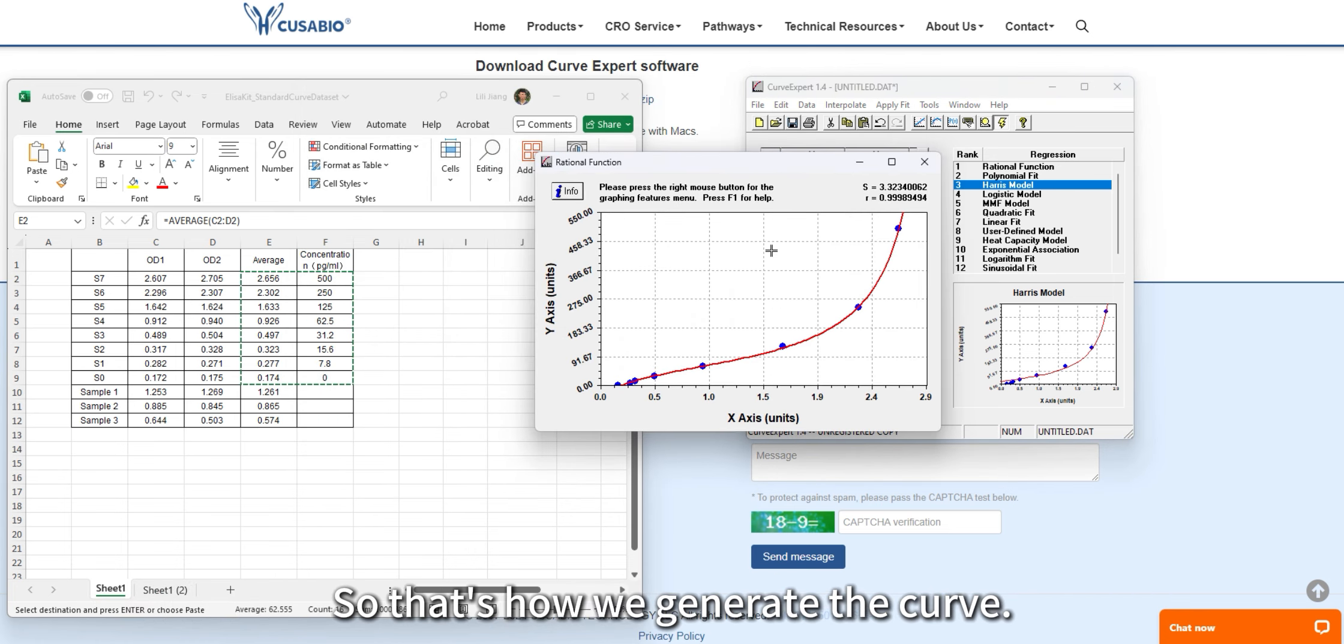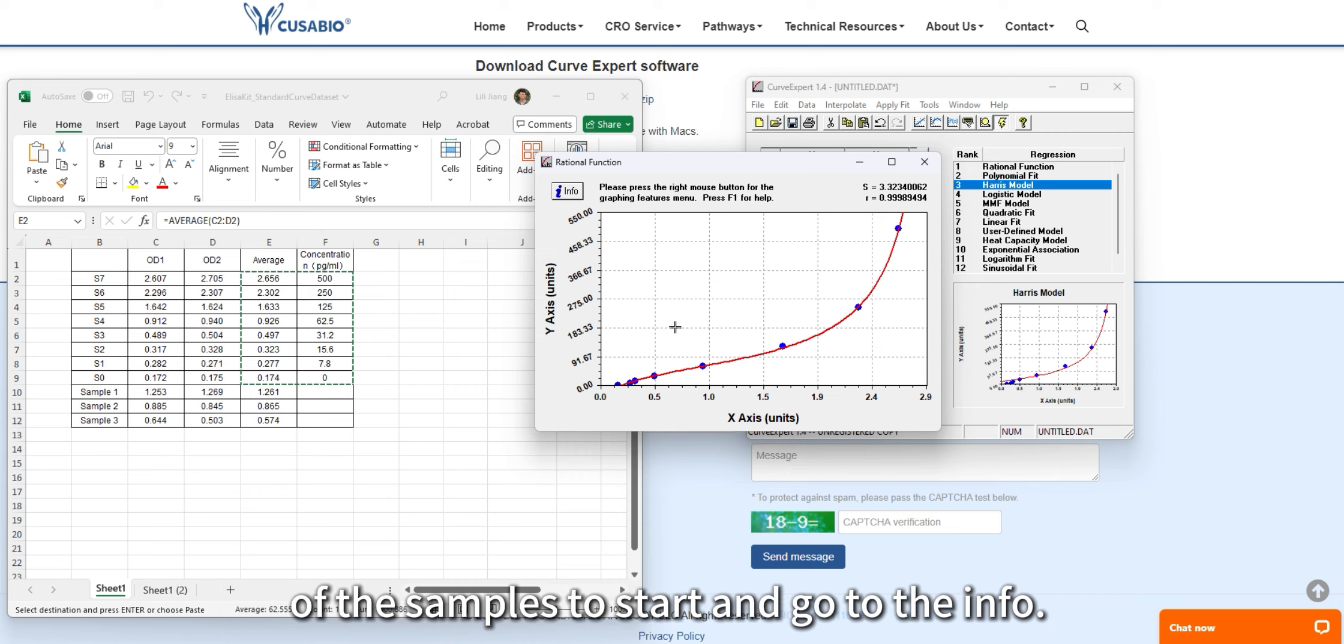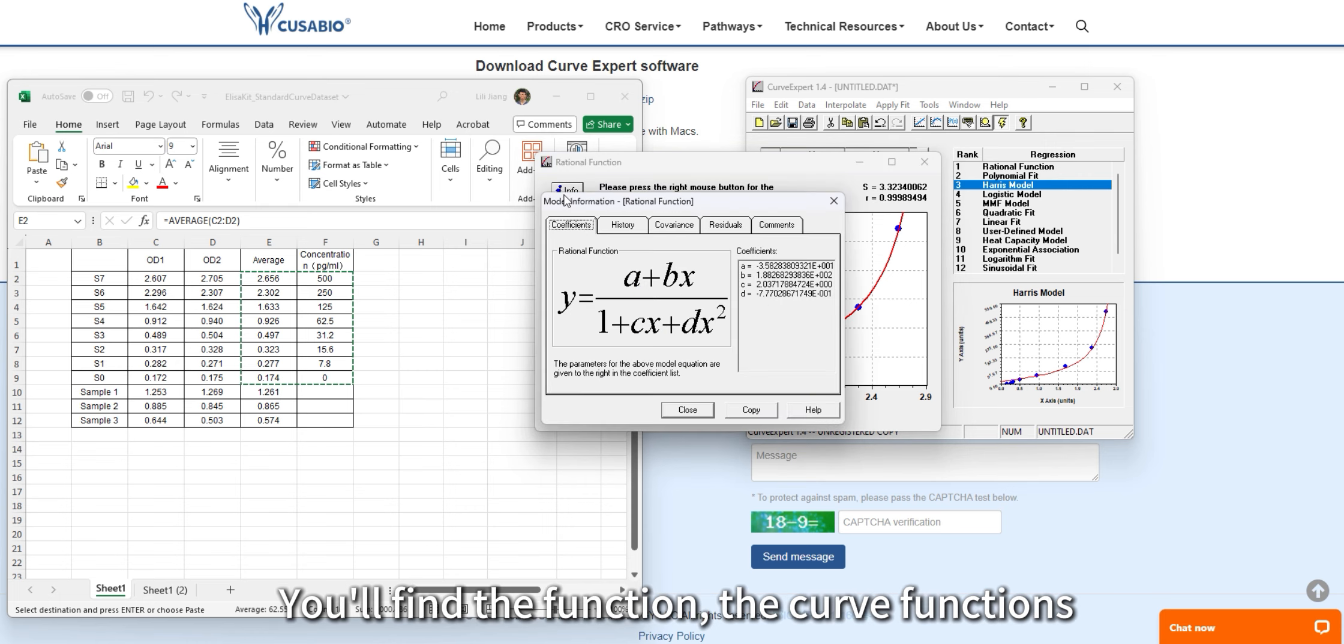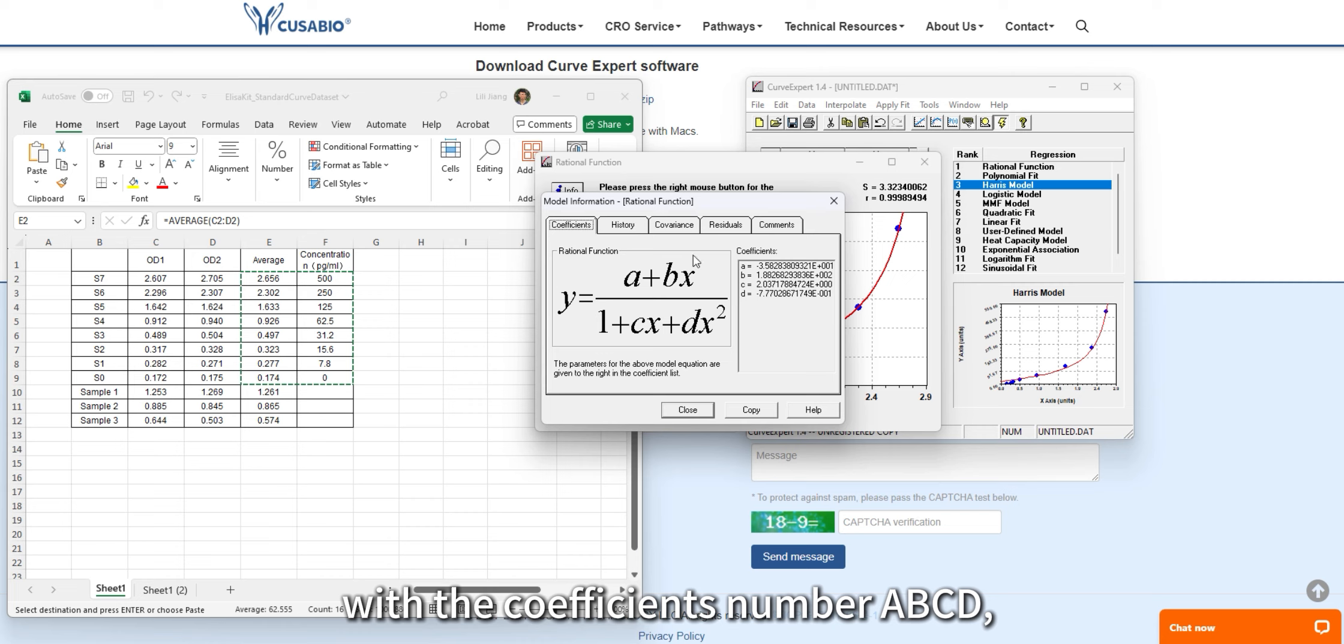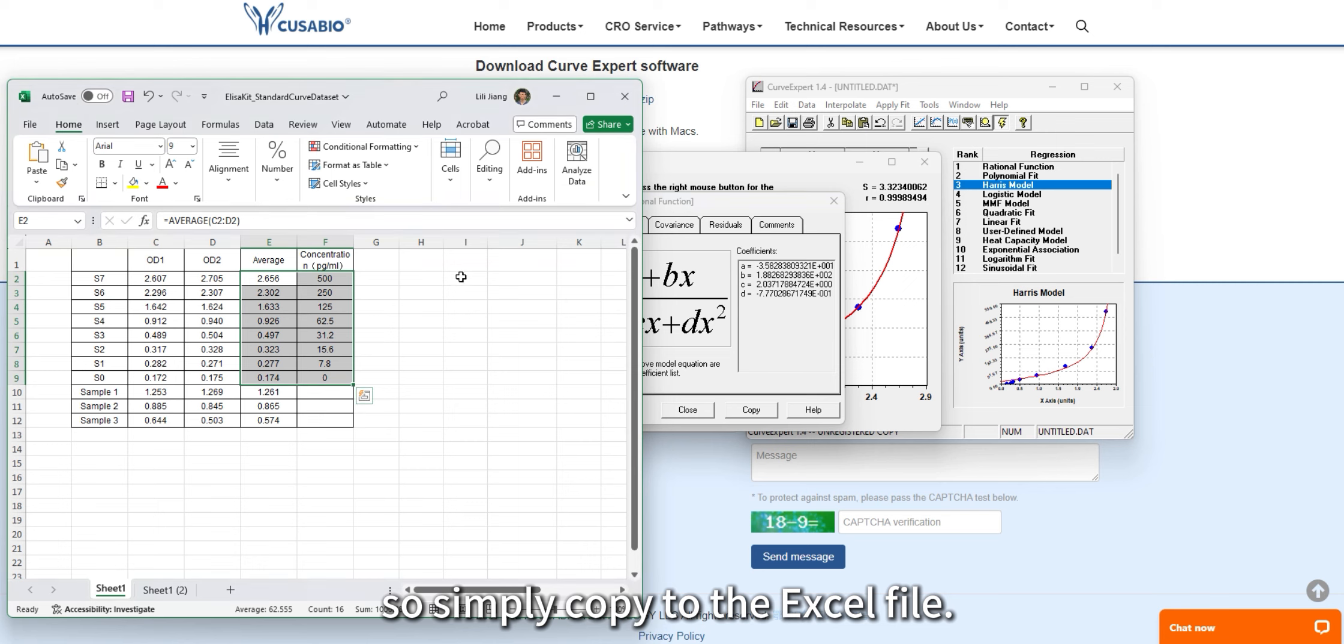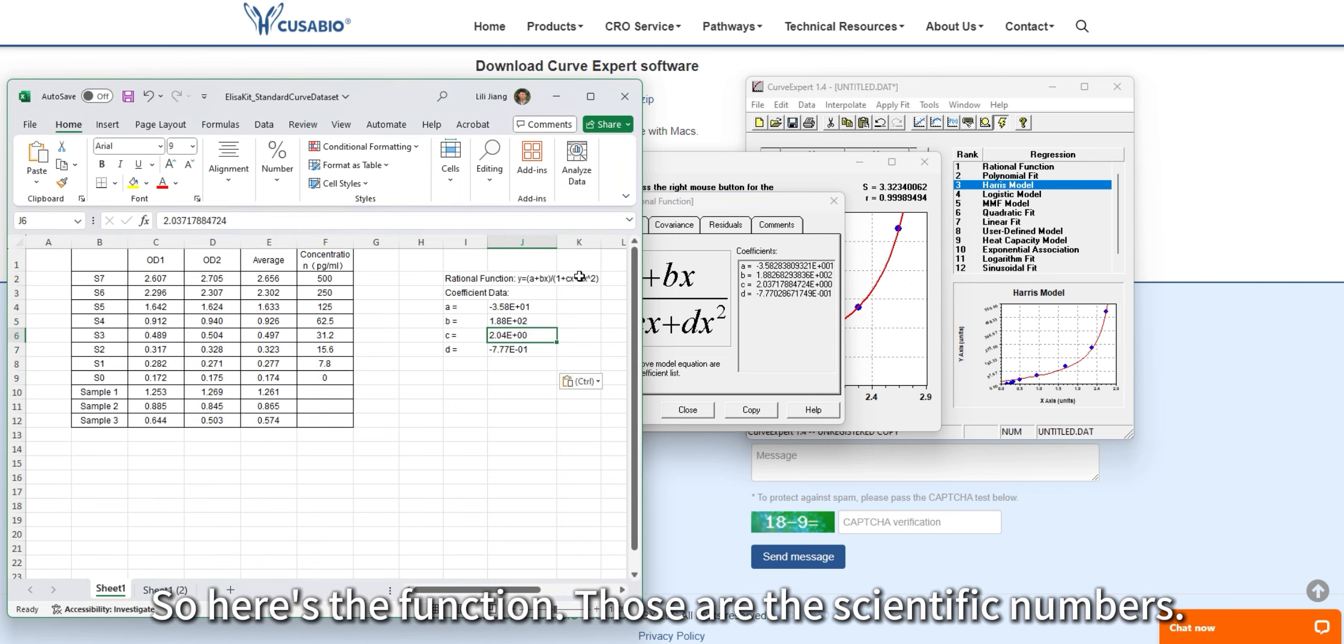The next step is calculating the concentration of the samples. To start, go to Info. You will find the curve function with the coefficient numbers A, B, C, D. Simply copy this to the Excel file. Here's the function with the scientific numbers.